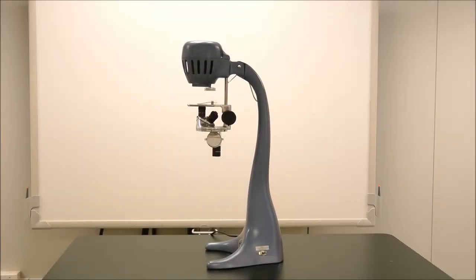The microprojector X1000 is a very stable technology that has been available for many years. Uniquely, it will project a microscopic image either vertically on a table or horizontally on a white projector screen.